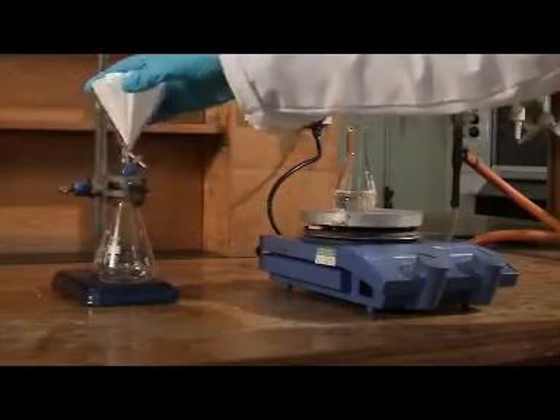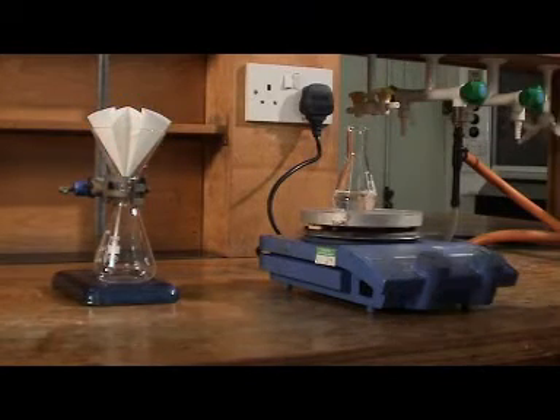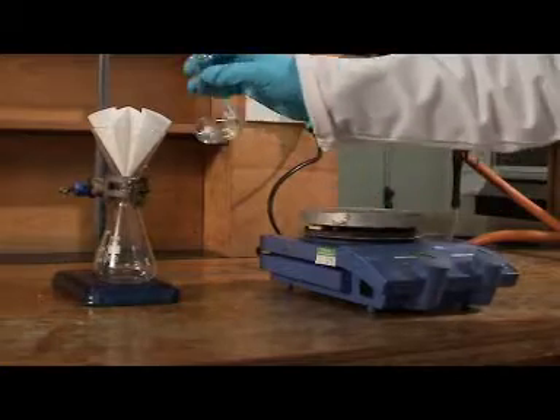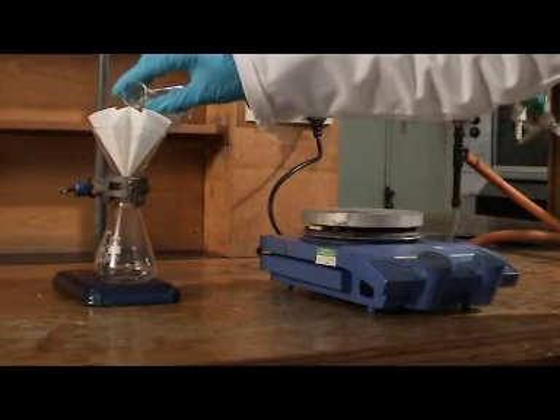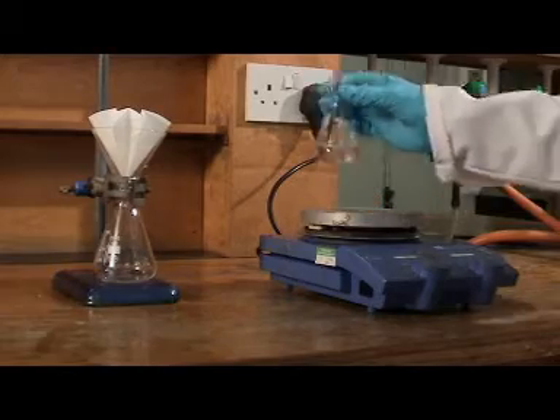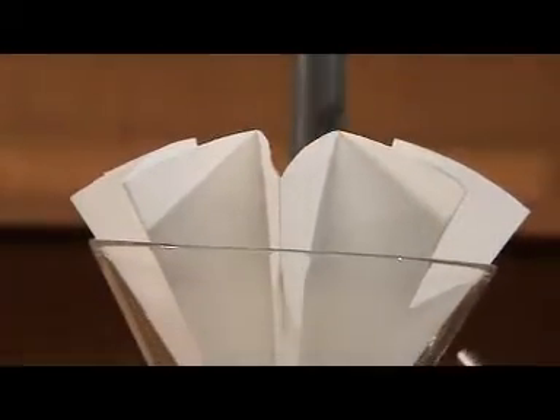We're using a hot stemless funnel to minimise the amount of compound which crystallises out within the funnel during filtration. Pour just a small amount of the hot solution into the bottom of the filter paper. Keep adding a small amount at a time — don't be tempted to pour it all through at once.